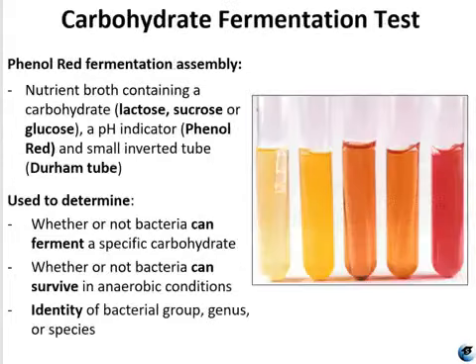So we already saw in Lab 6 how you can test for fermentation of some sugars. If you remember, the MacConkey, EMB, and MSA agars all test for fermentation. MacConkey and EMB can test for fermentation of lactose. MSA can test for fermentation of mannitol.